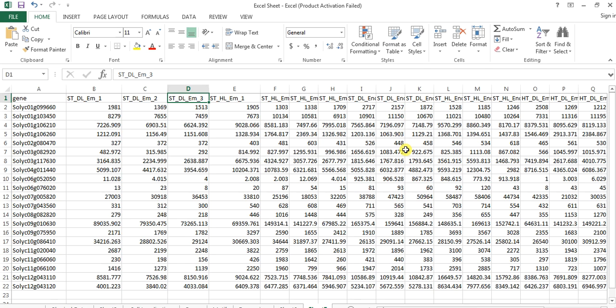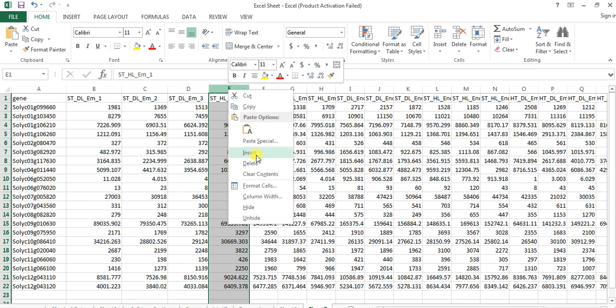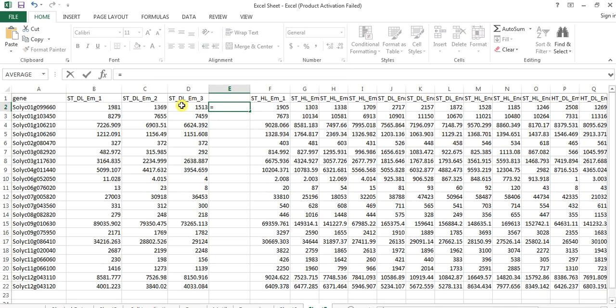So you can present these in your manuscript in different ways, through making a heat map and also in the form of an Excel sheet. You can also present them as a mean value, because these are three replications, so you need to express them as a mean value. Like here you can add these all, divided by 3, so this is the mean expression level of these genes.